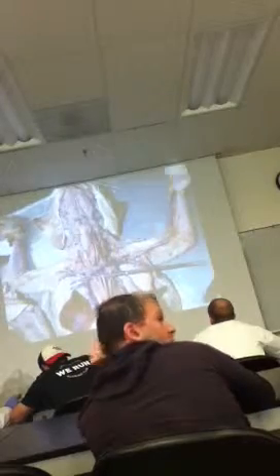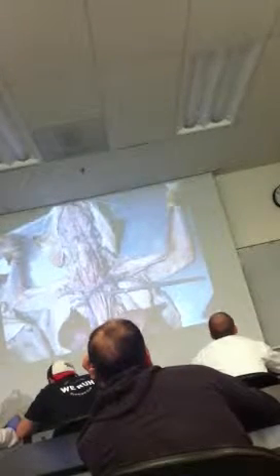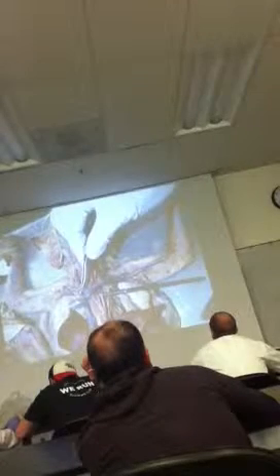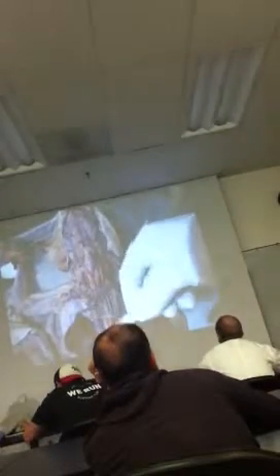Okay. Then we have the same things for the right side, the other side, right? This all comes here to subclavian, and this one external jugular, and we have a brachiocephalic here. You see, one side might be shorter, in different cats might be a little bit different, but still you see all the parts. Right brachiocephalic vein, left brachiocephalic vein, these two join together to make a vein that goes toward the heart that you see and pours into the right atrium.